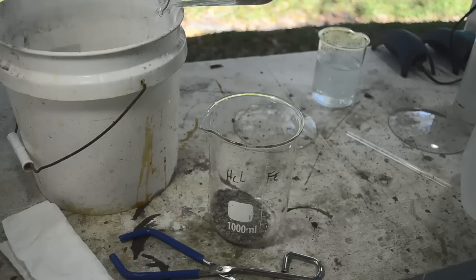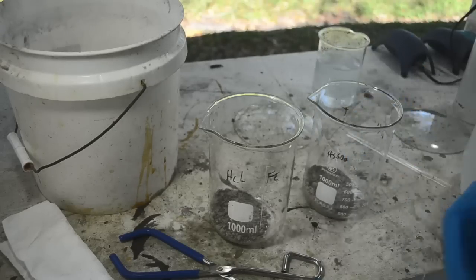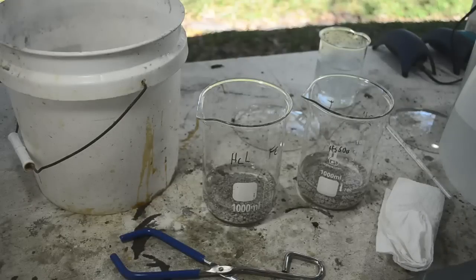Two, three more might be enough. We'll see. Okay, there's been a few more rinses. Let's measure it again. I have to say, this looks like super, super clean silver in there. I see lots of shiny crystals in both of them. Very sparkly.